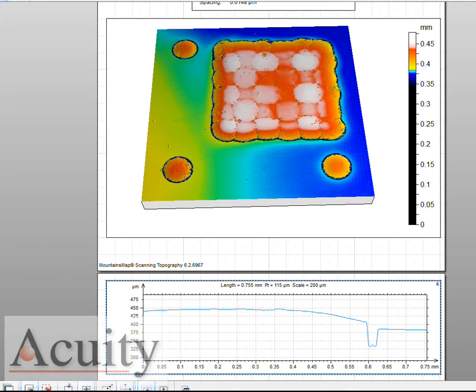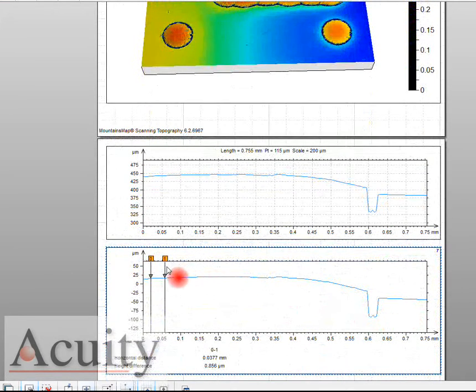And if we wanted to, we can come in and we should be able to make that measurement showing the difference between the two parts and roughly the top peak. We're showing about a height difference of 61.7 microns between that raised surface and the primary base surface. This is where we probably lost data. I'm not sure if this artifact is actually an indentation there, or whether it's just a sort of out of range condition.